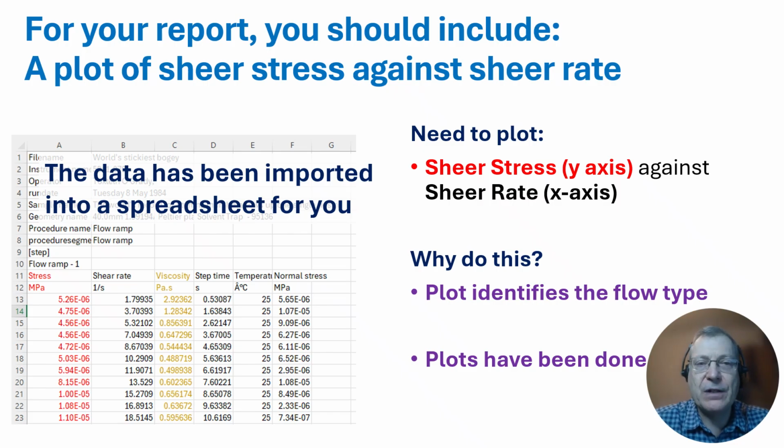You do not need to explain the mathematics in detail. What I'm looking for is interpretation. Does the stress increase linearly or non-linearly? Does the curve suggest shear-thinning behaviour, which is typical of creams and ointments? If you can insert the graph correctly and explain this in plain words, what the shape of the graph tells you about the product, you're doing exactly what this part of the assessment is designed to test.